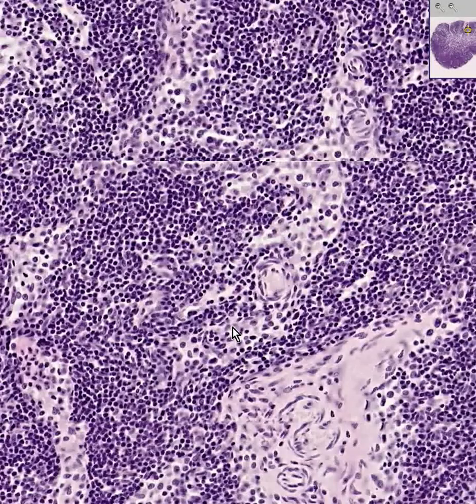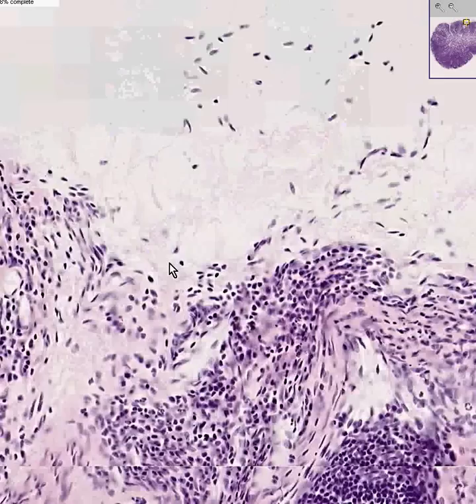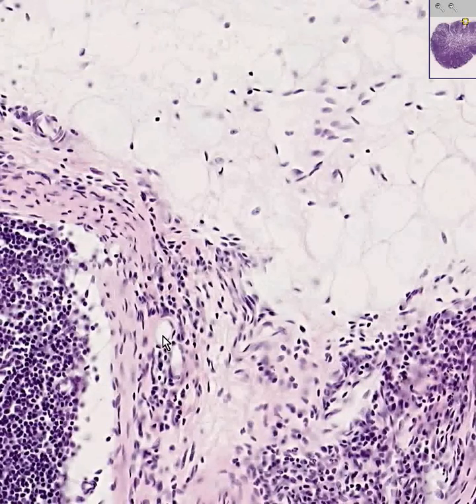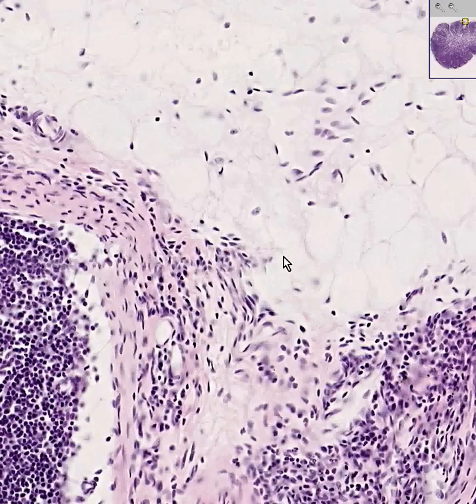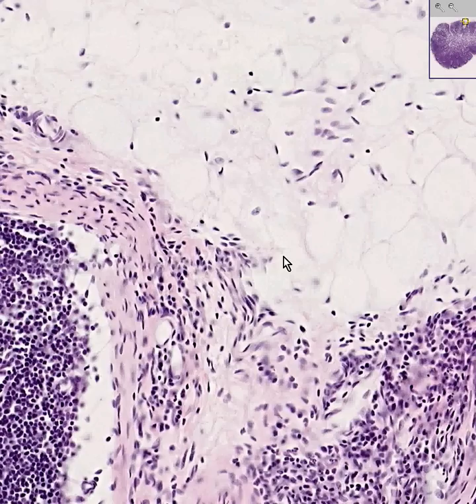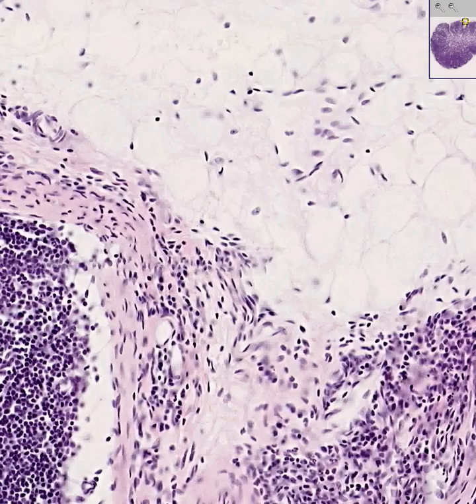If you look at the periphery of a lymph node and you see thin blood vessels that don't appear to have any blood inside them, they may very well be lymphatic vessels. And 99% of the lymphatic vessels coming into a lymph node are afferent — coming in — while there is only one major efferent vessel coming out as part of normal lymph drainage. Histologically they look the same, so if you see a lymphatic vessel outside the lymph node or near the capsule, most likely it's going to be afferent. And all that surrounding material is just regular fat. Thank you very much, and we're off to bigger and better things.